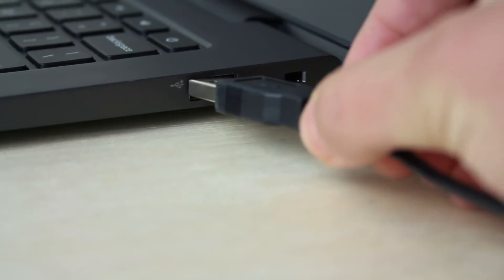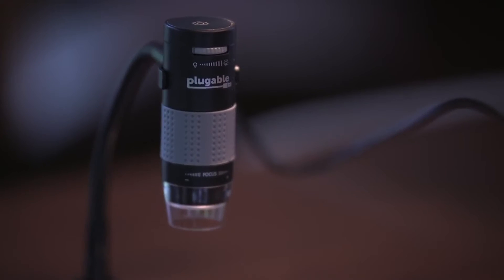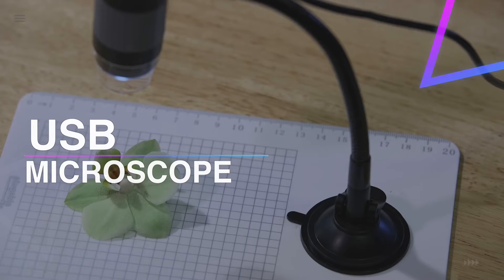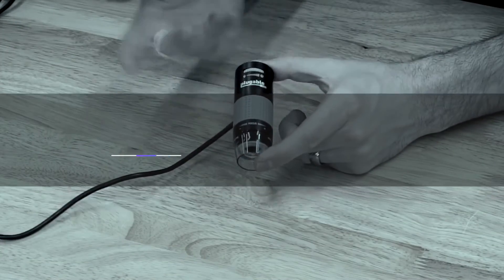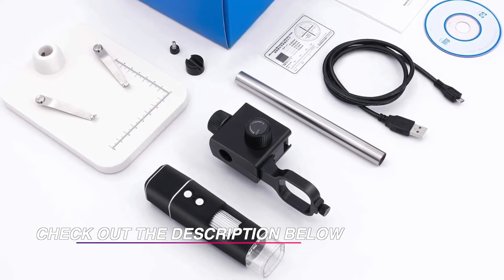When you want to observe things closely, don't turn to optical microscopes, but to digital USB microscopes. They provide great practical features like screen display, maximum zoom, and video recording. Confused about which one to buy? We have got you covered. Here are our top six recommendations.